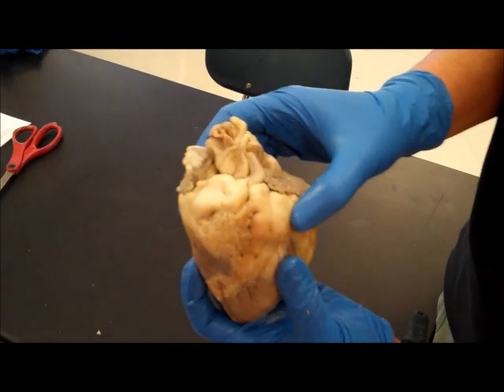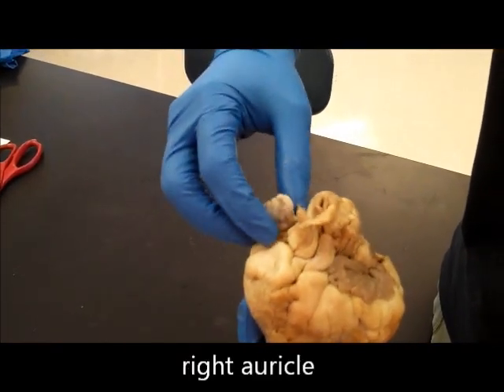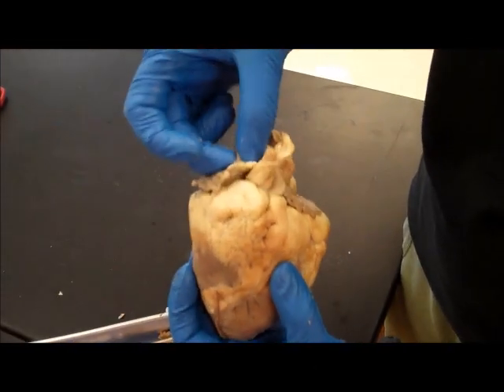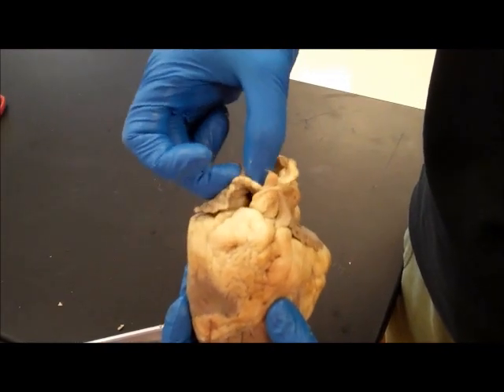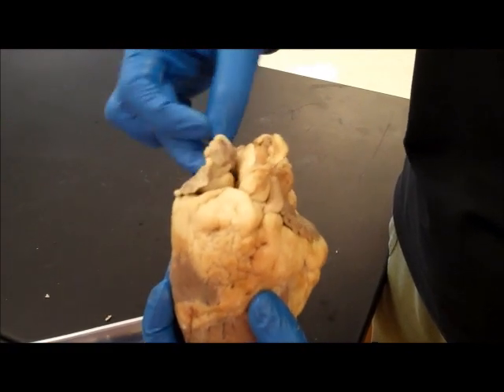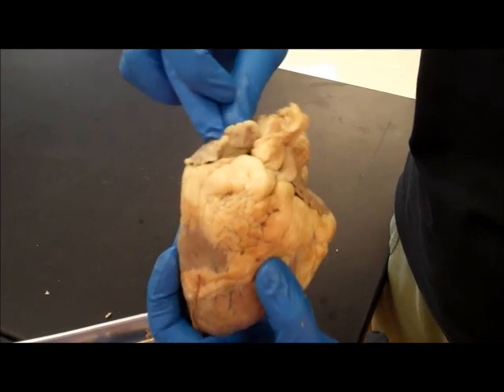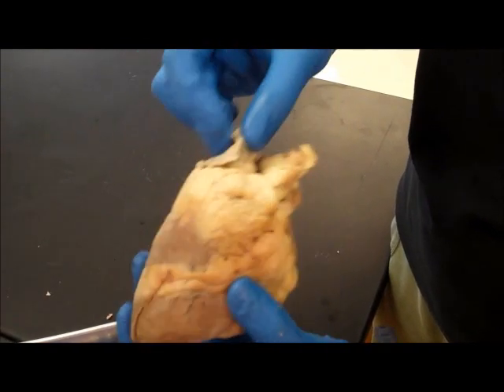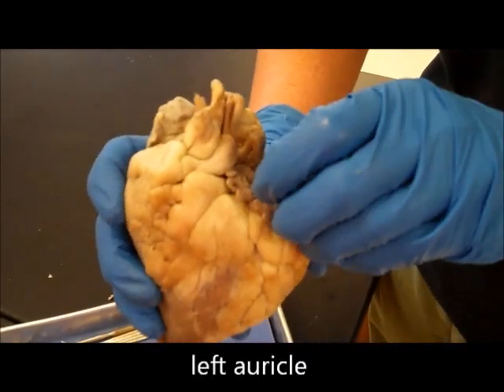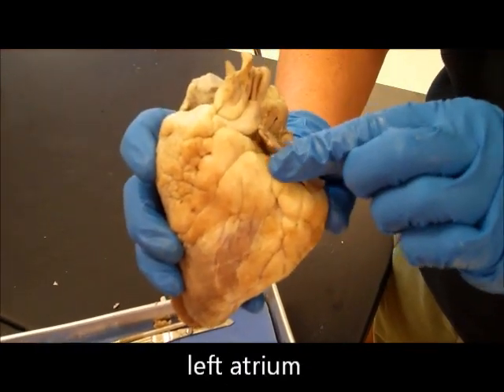Looking to the top of the heart, we have the right auricle, or also the right atrium. And actually the auricle is an ear-like flap that extends off of the right atrium, and this auricle allows the atrium to become larger in size when the atrium fills with blood. We have the left auricle, which leads into the left atrium, and that left atrium is covered by all of this fat.